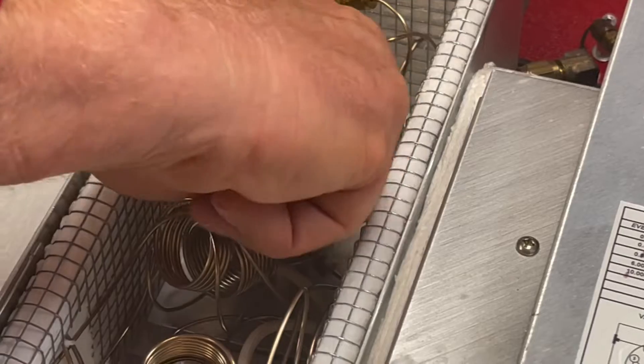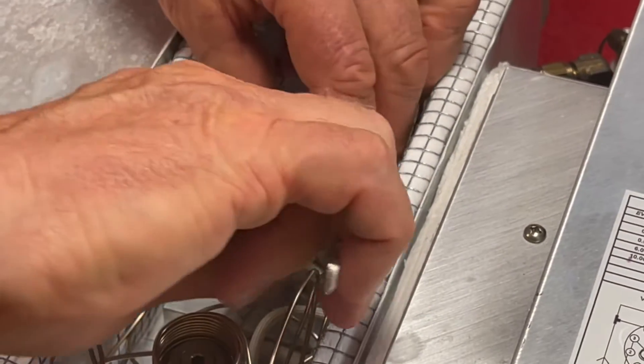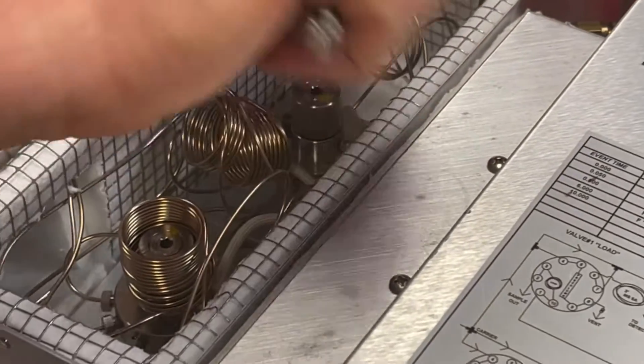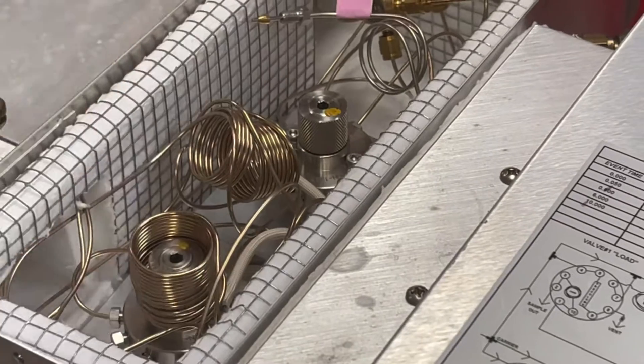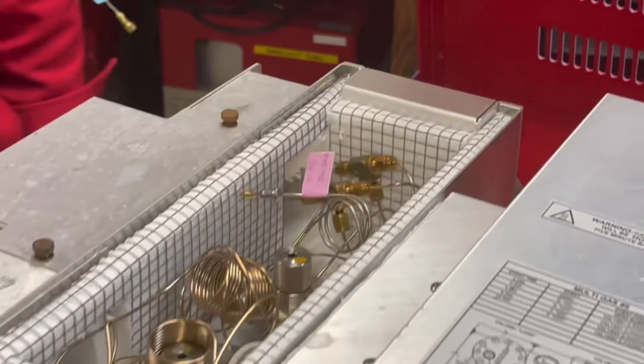Now I'm going to tighten this back up. Usually you can go pretty much all the way to completely tight with your fingers and then use the pair of pliers to just make sure it's really tightened down all the way. You don't have to really struggle with it — just make sure it's snug. And that's really all there is to changing a rotor.